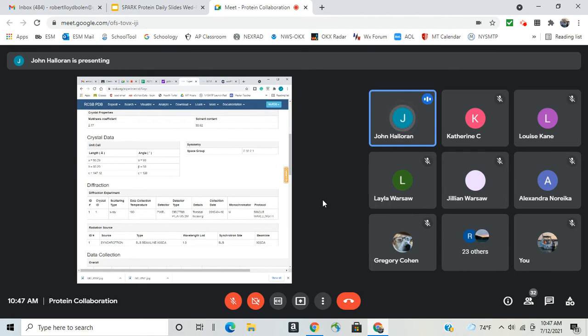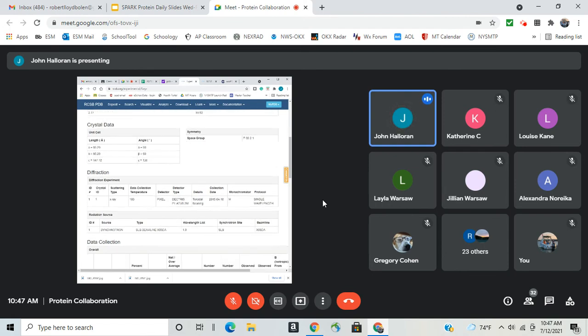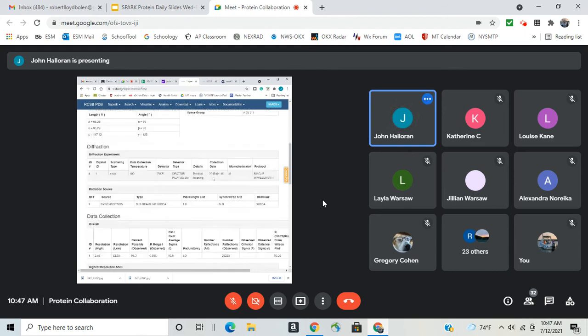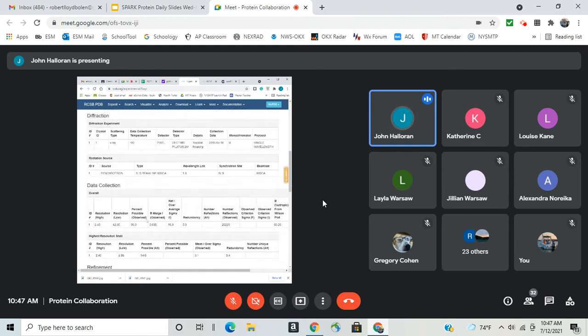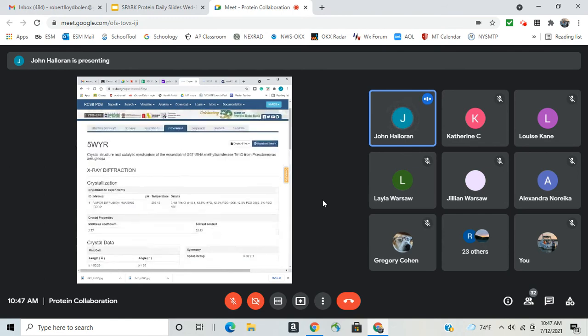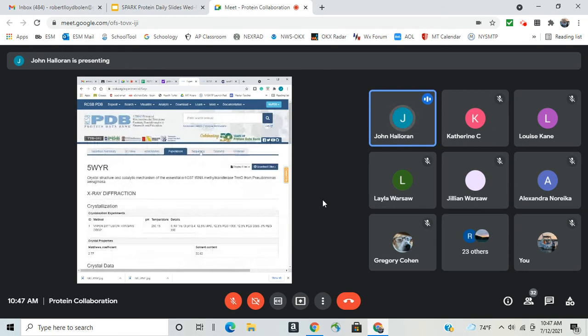It's almost like we were able to see the protein from a slightly different angle, and we got a spot on the protein that normally isn't seen. And then there's some more specific information about the actual data collection, which we're not going to go through because that's a little high end right now.